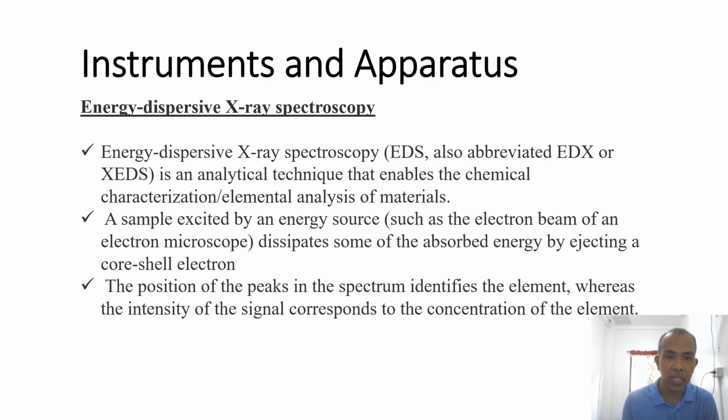A sample excited by an energy source, such as an electron beam of an electron microscope, dissipates some of the absorbed energy by ejecting a core shell electron.